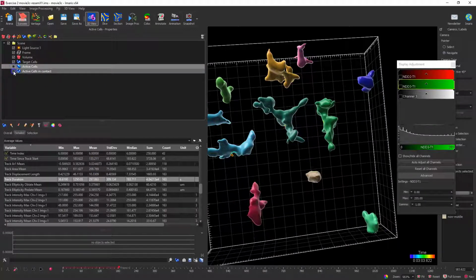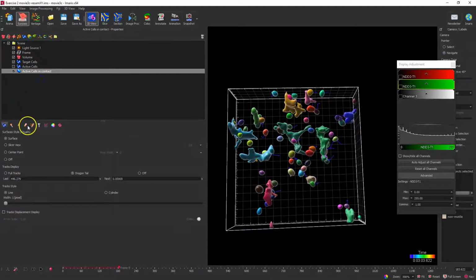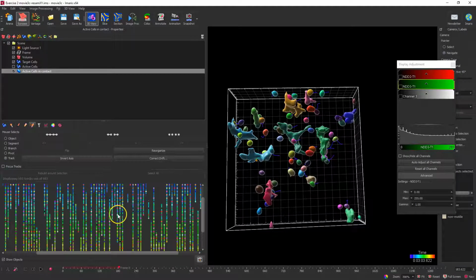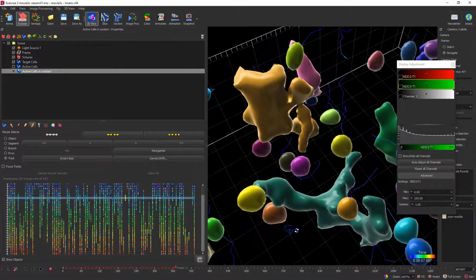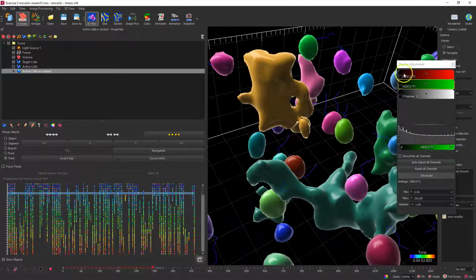And I just wanted to show you this one too. This is another result where I filtered and then I retracked based on that. We can see here that there are quite a bit of tracks of things that come in contact. But you can see that even for an object like this, we just get the time points where it was probably out here.